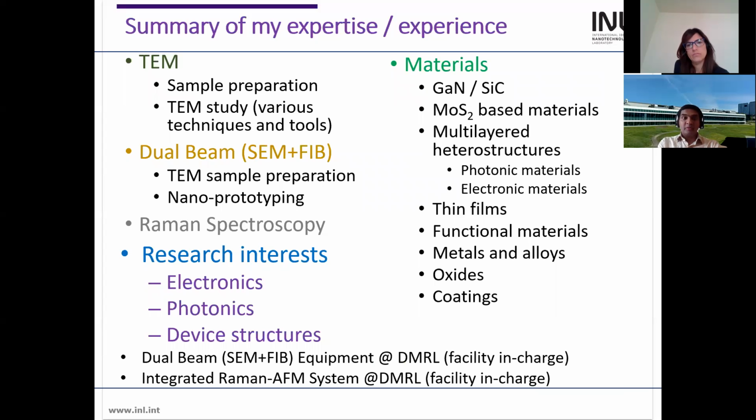So I mainly do TEM. I've been working with the dual beam, which we have used for many sample preparations, then Raman spectroscopy, then the different classes of materials: gallium nitride, silicon carbide, all electronic materials, then other coatings, then oxides, other different thin films and functional materials. So I've worked on a range of materials, and my research interests are in application oriented materials, starting from photonic materials to electronics and device structures.